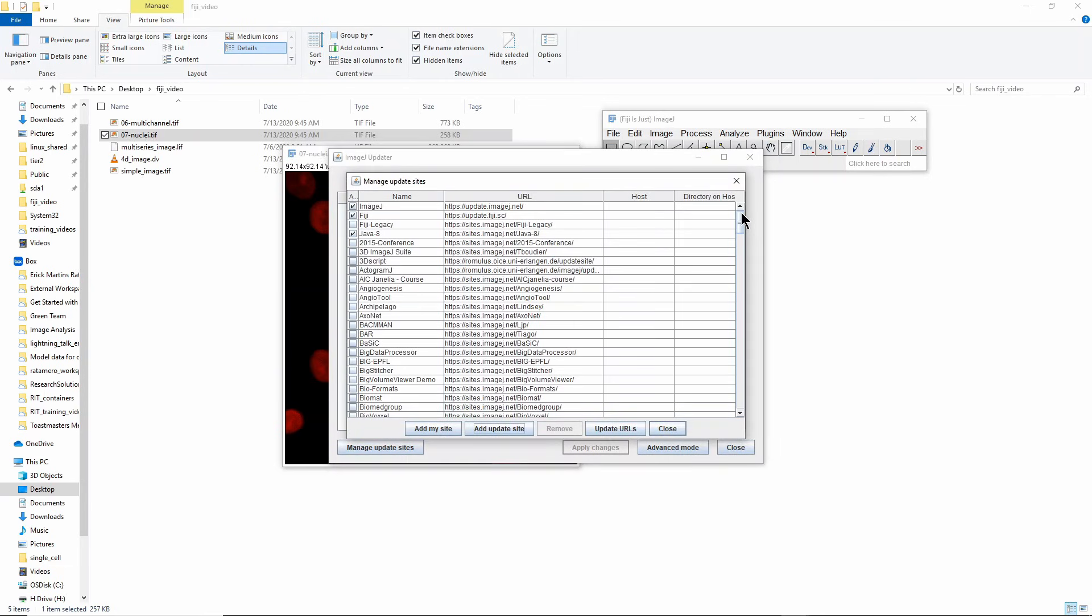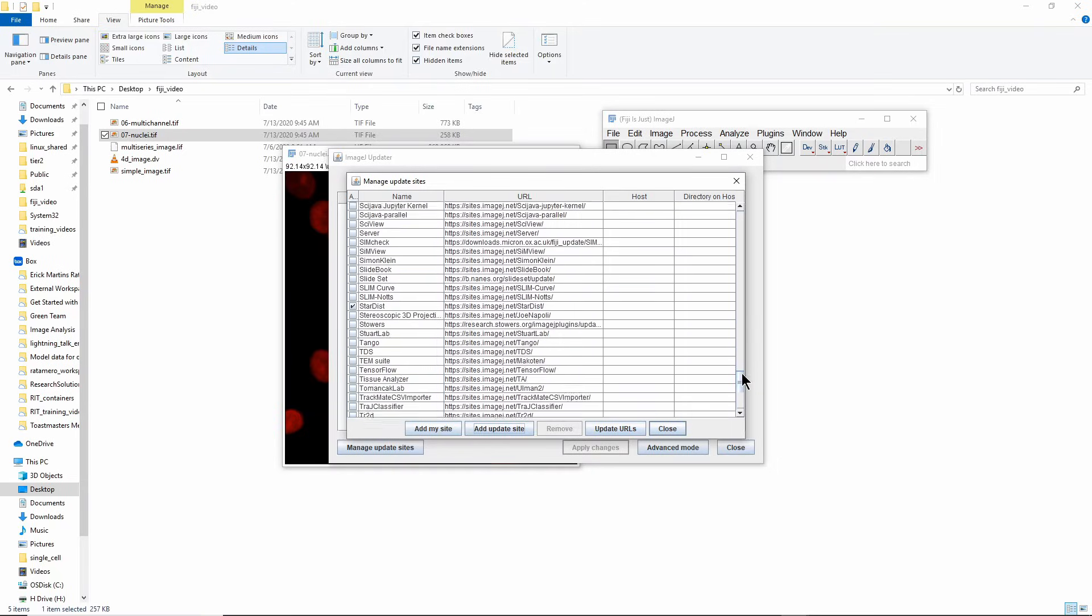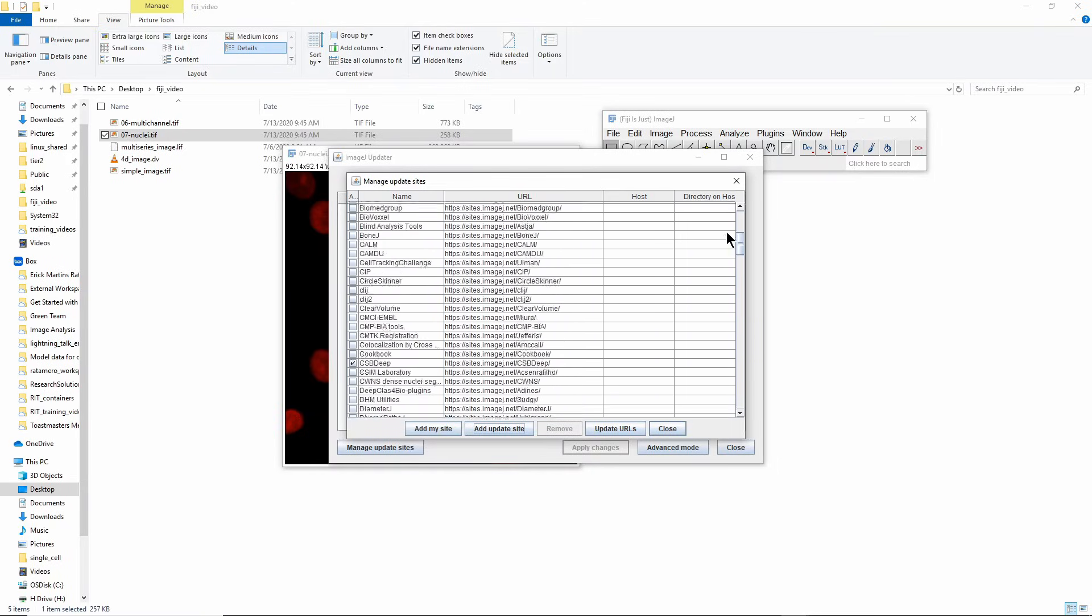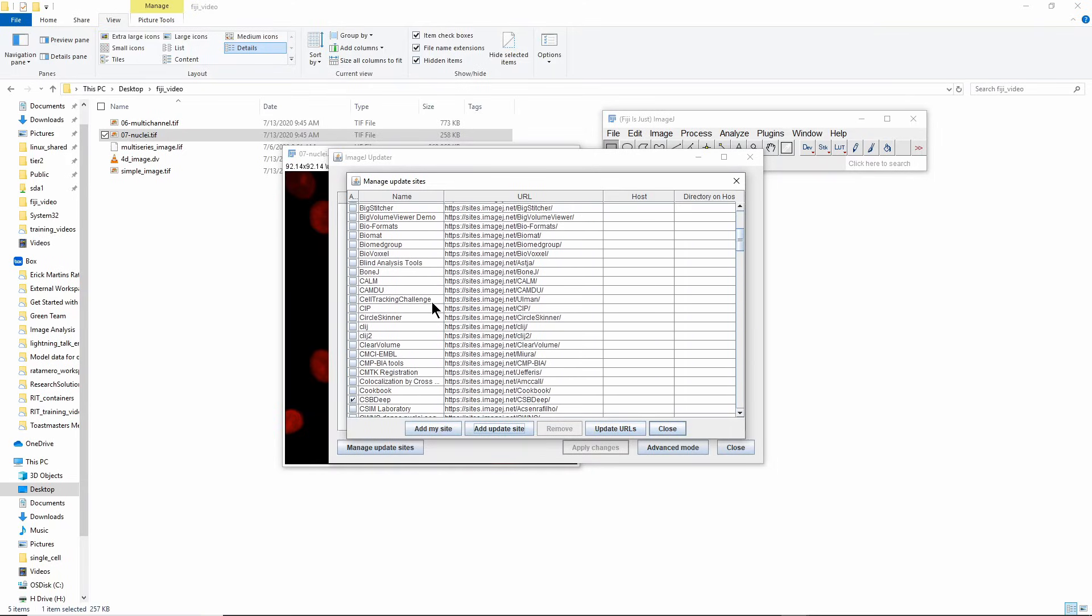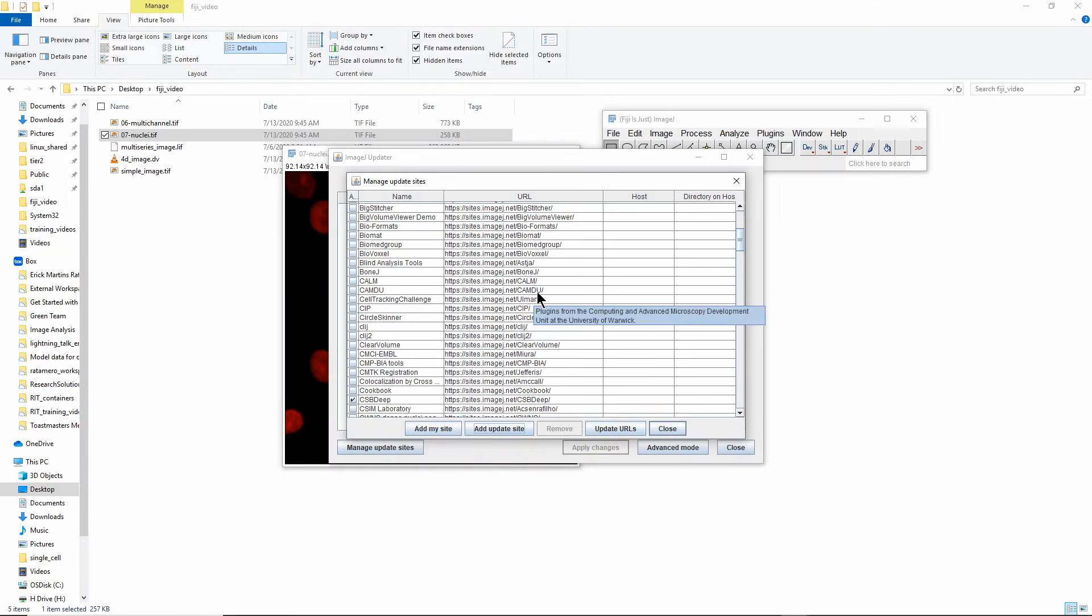The way you install new things is you go to Manage Update Sites. If you click that you'll get a huge list of things that have been developed by other people. For example the one that says CAMDU here was actually developed by me, so you can actually develop new things and put them there for other people to use.